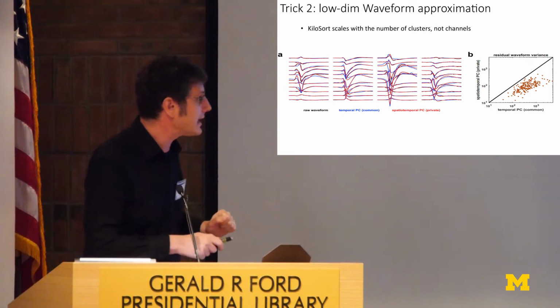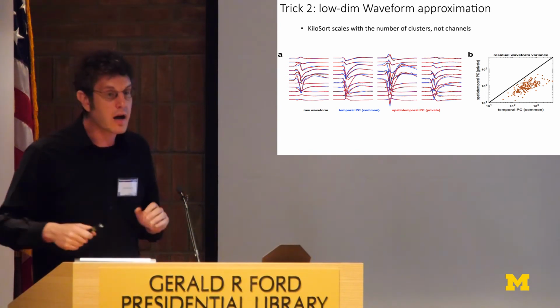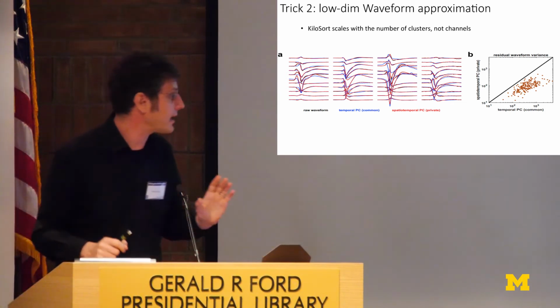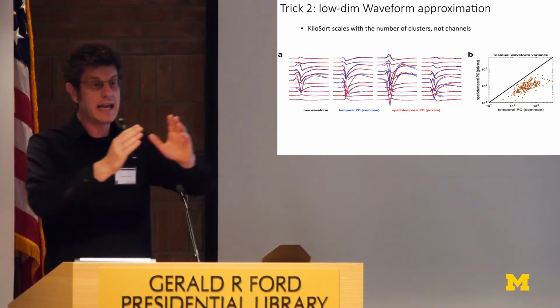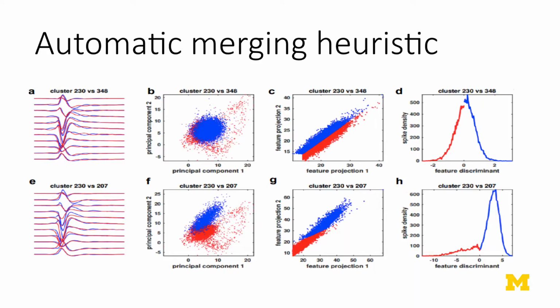And what that means is that the algorithm time scales with the number of clusters rather than the product of the clusters times the number of channels. This is why it can run in a reasonable amount of time even on this process of looking at all the data.